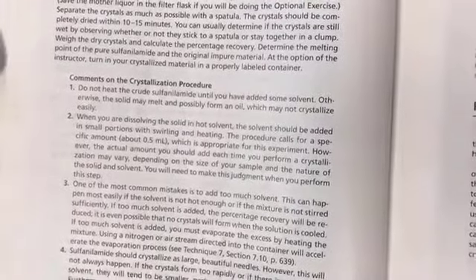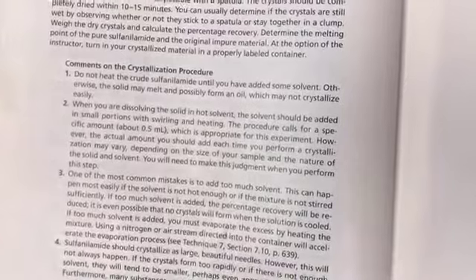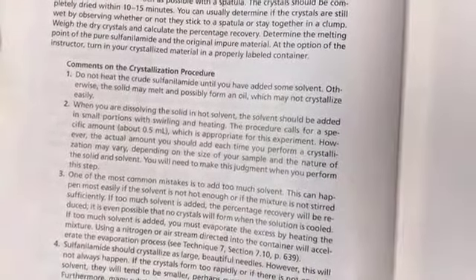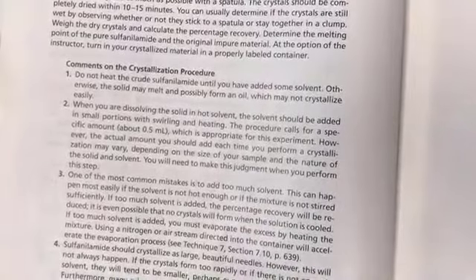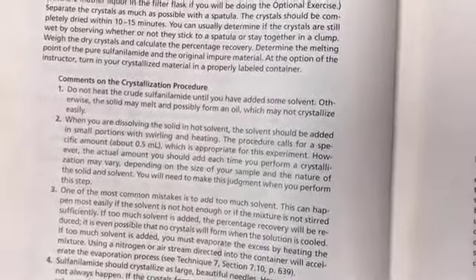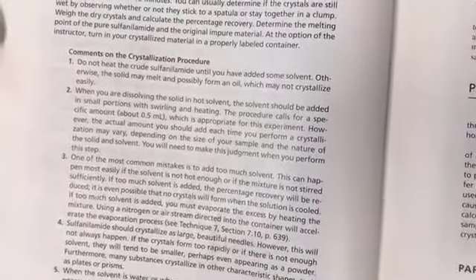And then when you add the hot solvent, as I already mentioned, you are going to add the hot solvent in small proportions. Add a little bit of hot solvent and then swirl it and try to dissolve, so that you will get the minimum amount.